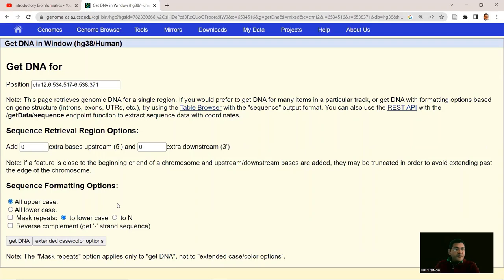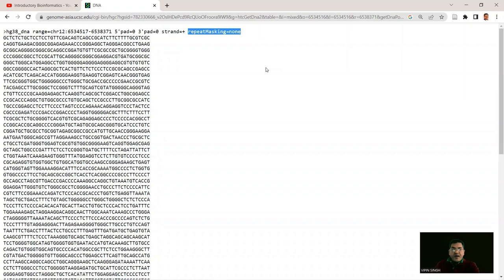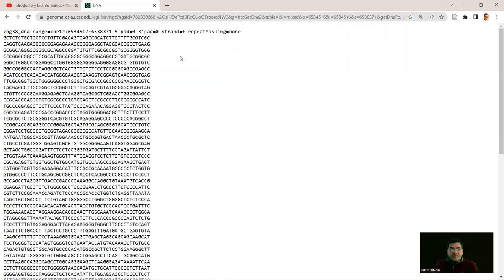The FASTA header confirms chromosome 12, positions 6,534,517 to 6,538,371, with zero 5′ and 3′ padding, plus-strand orientation, and no repeat masking. So part of the question is now solved — we know the location of the GAPDH gene in humans: chromosome 12, coordinates 6,534,517 to 6,538,371, length 3,855 base pairs. We'll now use this sequence to find where the GAPDH gene is in the chimpanzee genome.